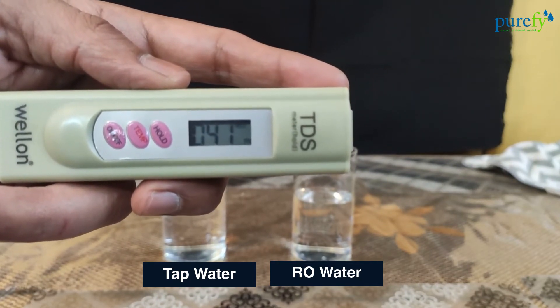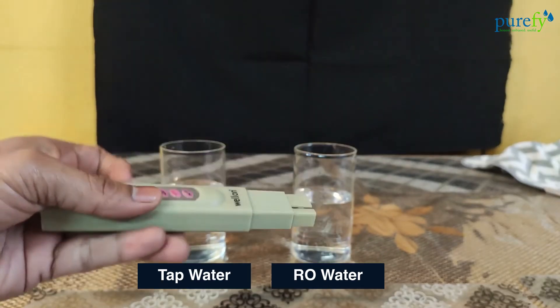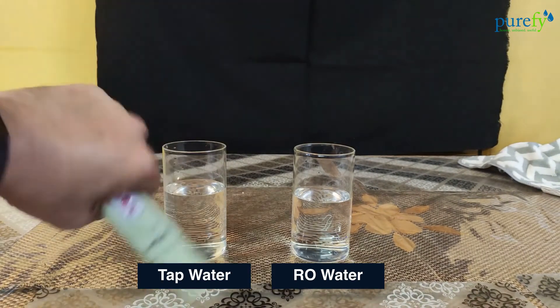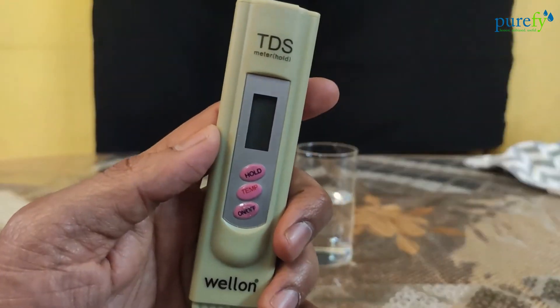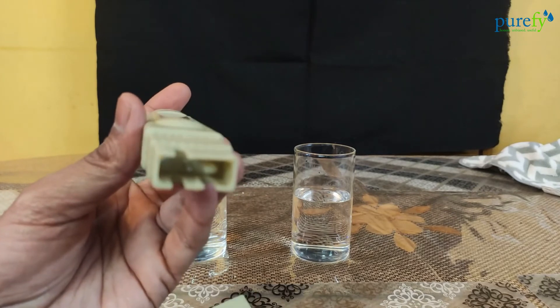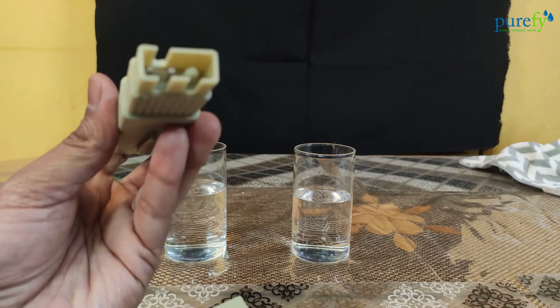We are using the Purit Copper Plus water purifier. Shake off all the water droplets before placing the protective cap on. This keeps the electrodes safe, prevents corrosion, and ensures that your TDS tester works effectively for a longer period.